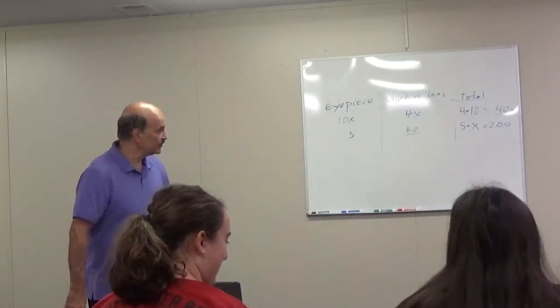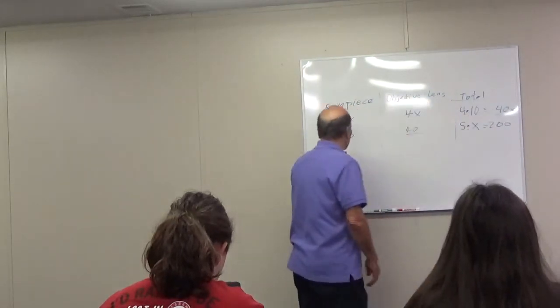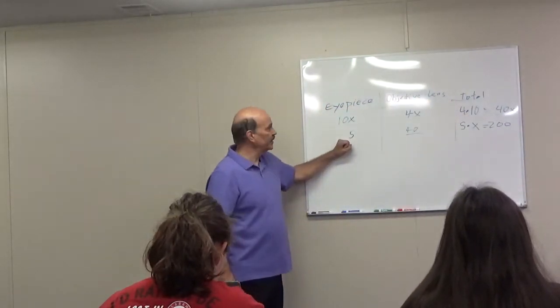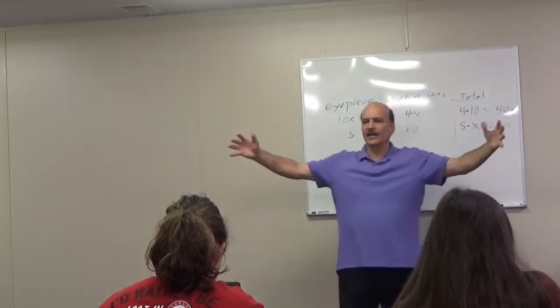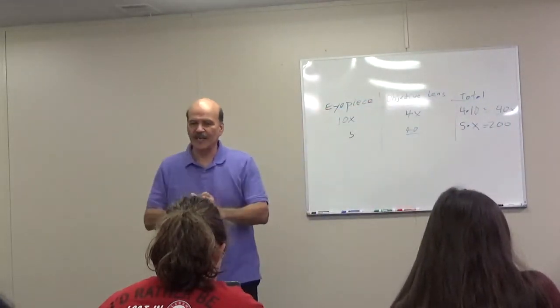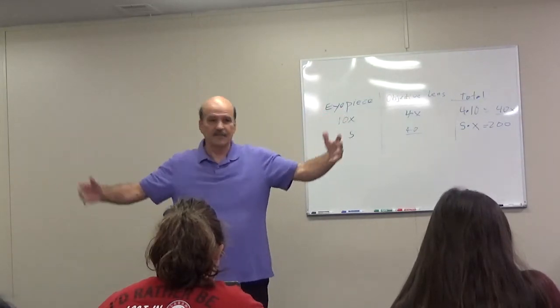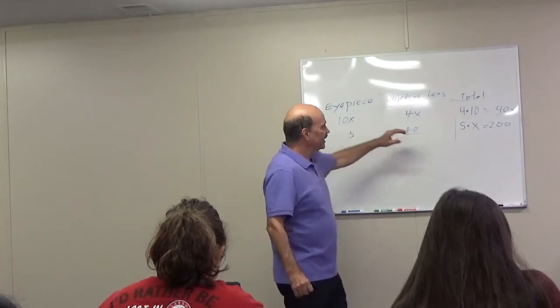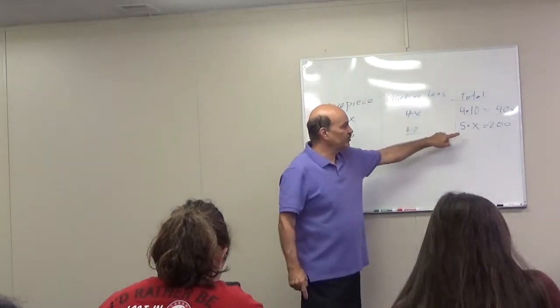But here's what happens. This one magnified 40 times, this 200 times. So you took the light here and you spread it out to cover 40 times, so the light is spread out 40 times. So you need more light, or it'll be too dark. Here, the light that came in is now spread out 200 times. So this second image is going to appear darker.